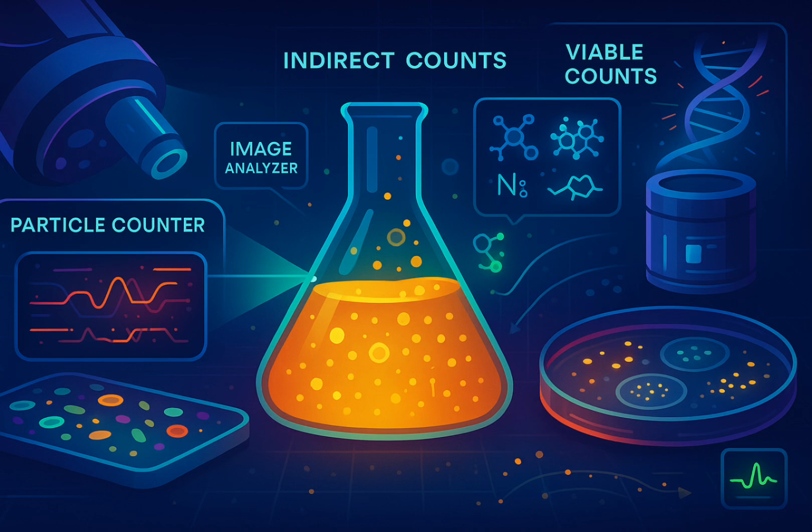Right. Okay, one more in this sort of automated category. Image analyzers. Think microscope plus camera plus smart software. Okay. You prepare a slide, the system takes pictures, and the software analyzes the images. It identifies and counts particles based on criteria you set: size, shape, maybe color if stained. So automation for microscopy. Kind of. You get some visual info, but computation does the counting.